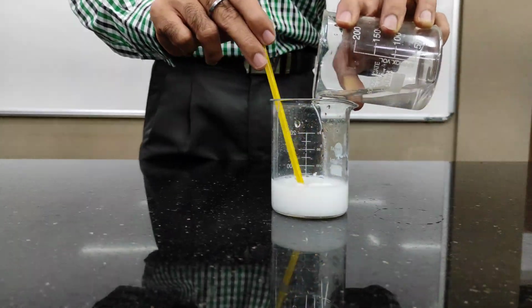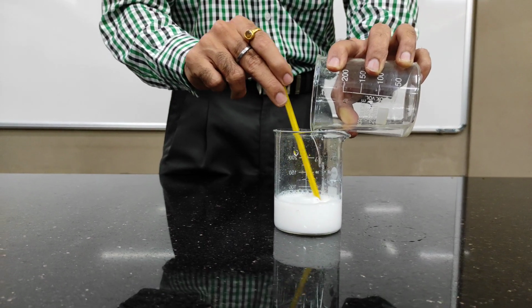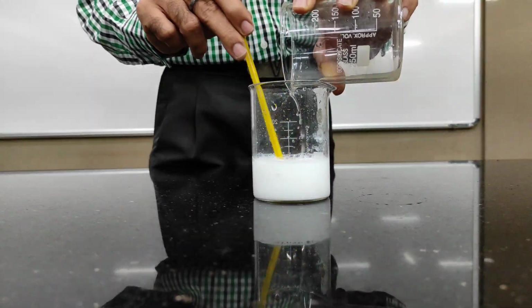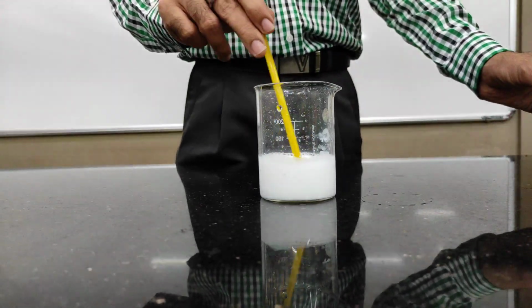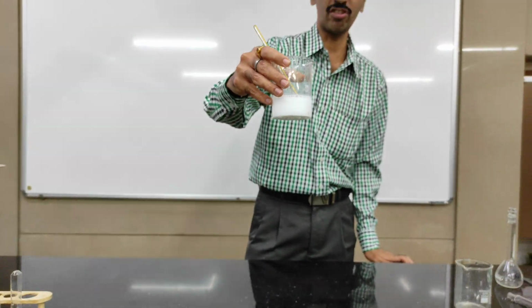Okay, can you see this very well? It's a visible change taking place, an indication of the formation of a precipitate. So very slowly, drop by drop, with constant stirring, the barium chloride has to be added. Here we go. So this is the barium sulfate formation along with what? NaCl. Can you just check it out?